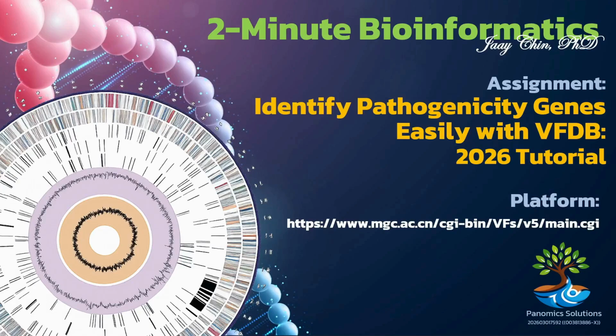Today, in this quick 2-minute bioinformatics tutorial, we will learn how to easily identify pathogenicity genes in a bacterial genome using the Virulence Factor Database, VFDB. In this 2026 tutorial, I'll walk you through a simple and efficient workflow to help you quickly screen for virulence factors and better understand the pathogenic potential of your bacterial samples.